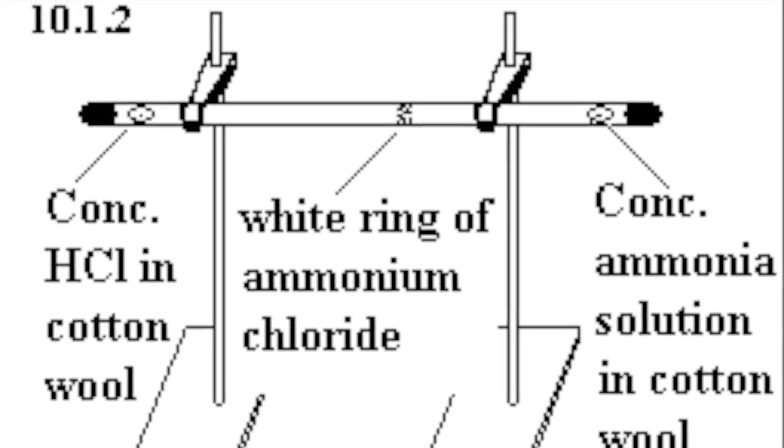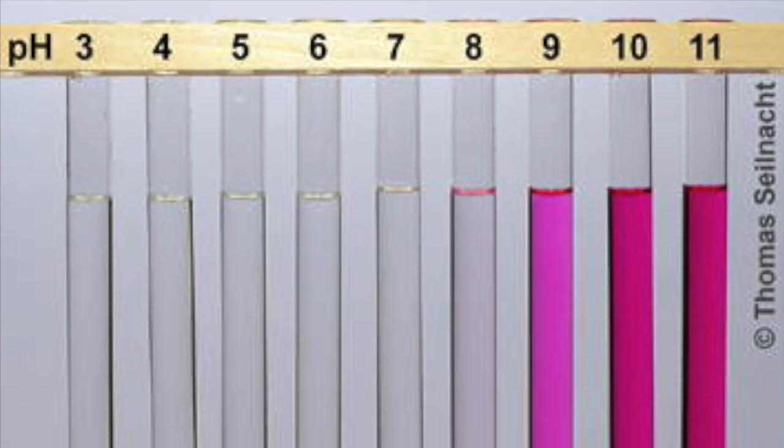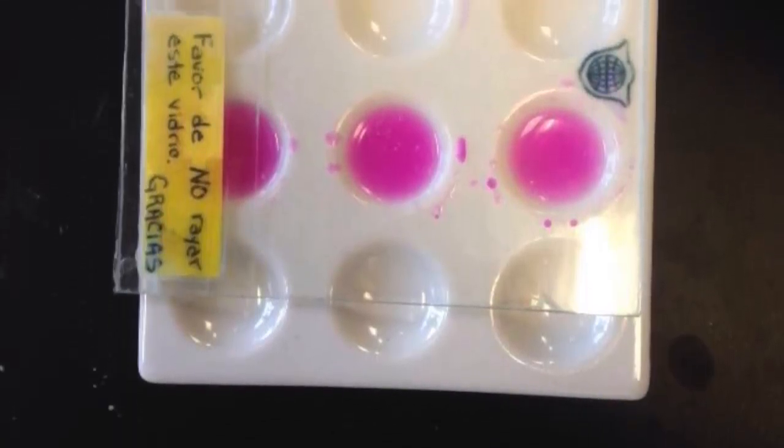Phenolphthalein is a very important substance because it helps us to easily determine the pH of the solutions. This practice helped us find fun in chemistry.